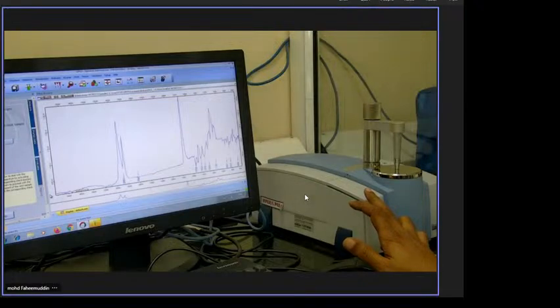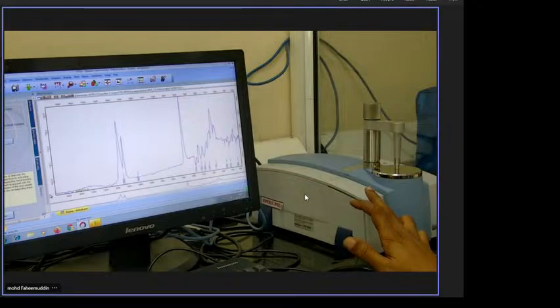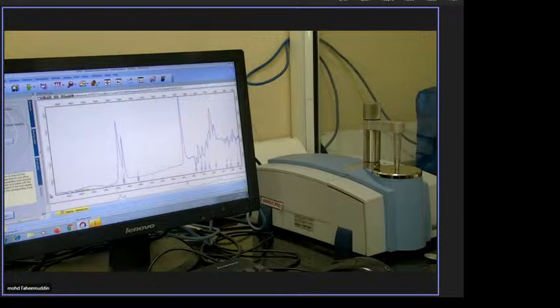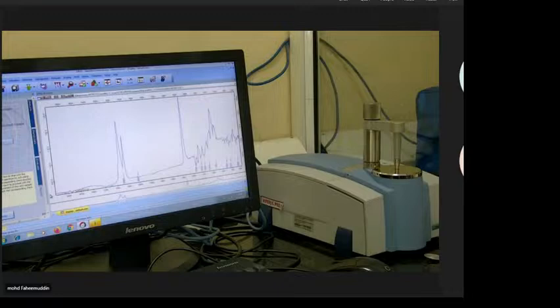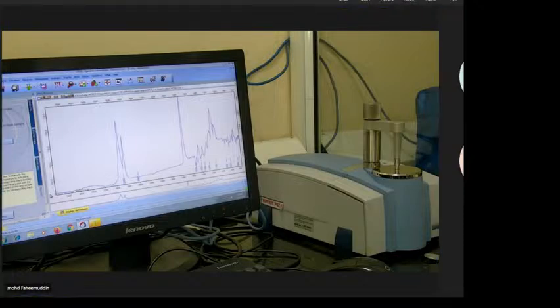Drugs and exporting the things. For regular manufacturing, one kind of instruments we require. For R&D and new inventions, we require some different kind of instruments. The thing is, how deeply you understand things and acquire knowledge will isolate you among the 1% or 2% of chemists or pharmacists.